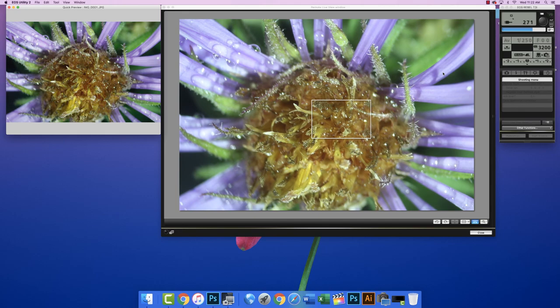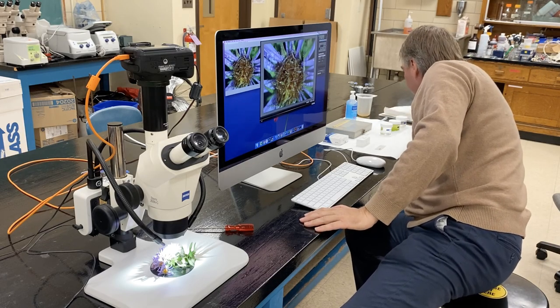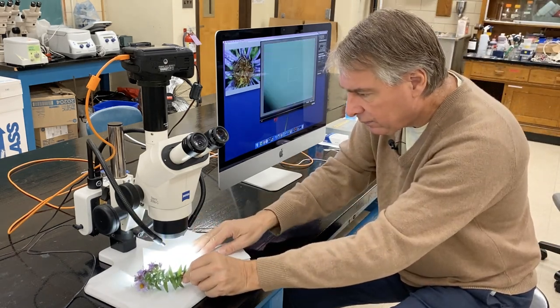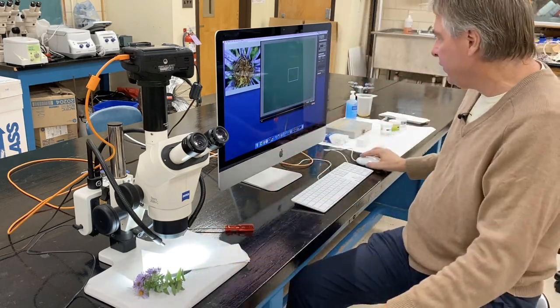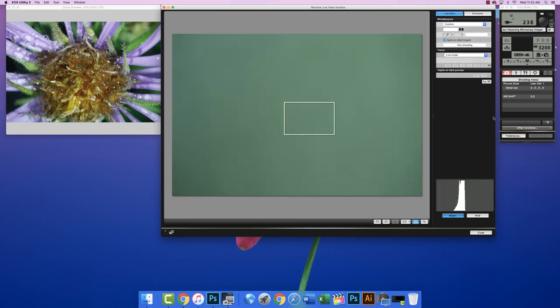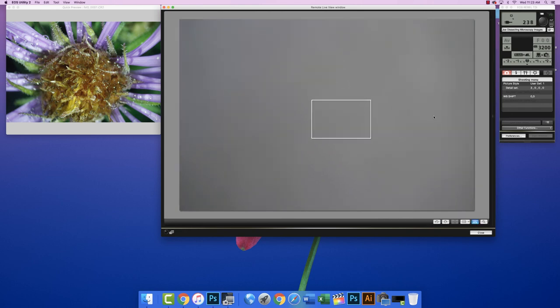To do a white balance, we need something white, like a paper towel. I can move the flower off and you can see that the white balance is way off. So I click on the window, click on the eyedropper, say OK, and click on the paper towel area. You can see it takes out all the color — it's just grayscale, the paper looks grayscale. Then I unclick the eyedropper and close the window.